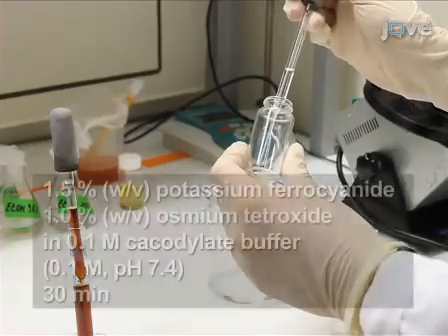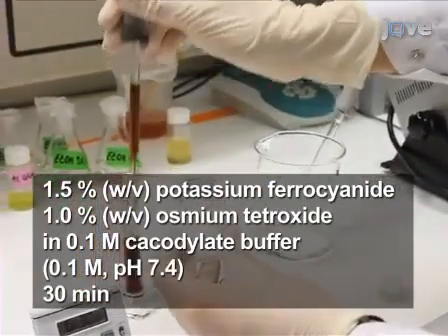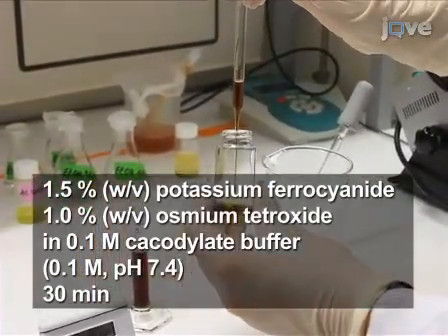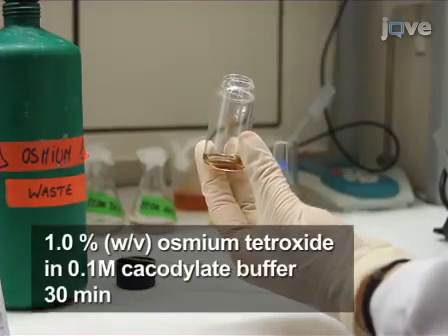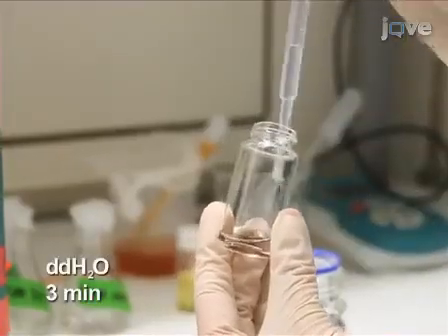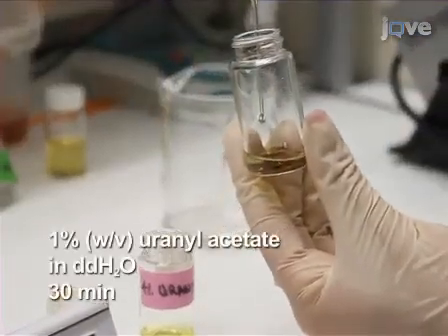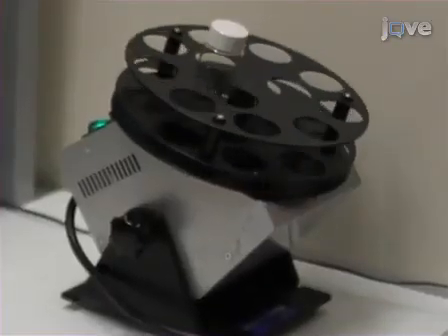Then, stain the samples with 1.5% potassium ferrocyanide and 1% osmium tetroxide in 0.1 molar cacodylate buffer for 30 minutes. Continue staining the samples with 1% osmium tetroxide in 0.1 molar cacodylate buffer for 30 minutes. Following this, rinse once with double distilled water for 3 minutes. Then, stain with 1% uranyl acetate in double distilled water for 30 minutes.